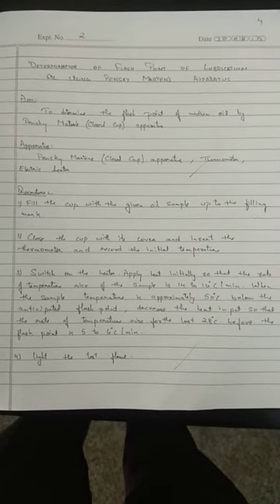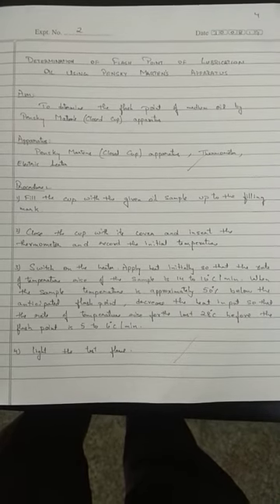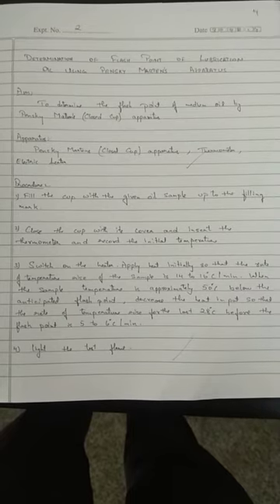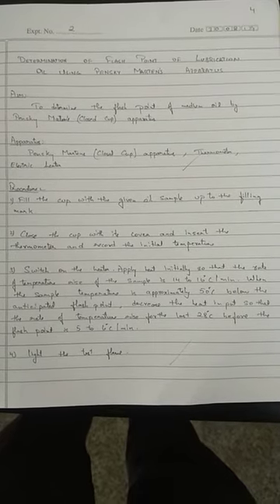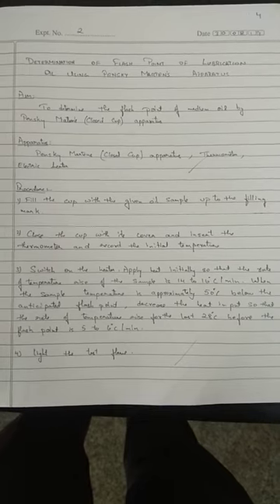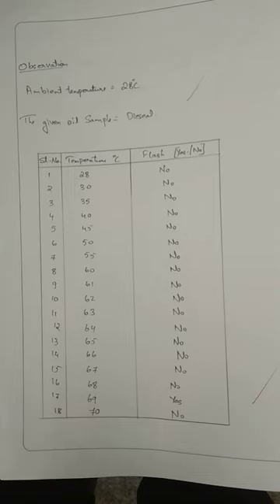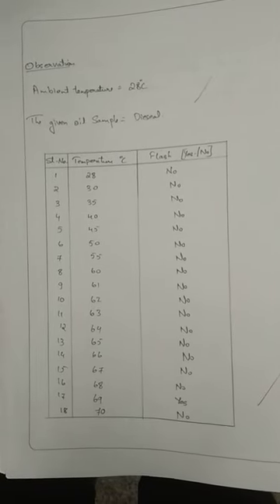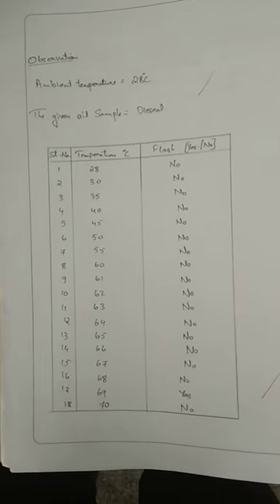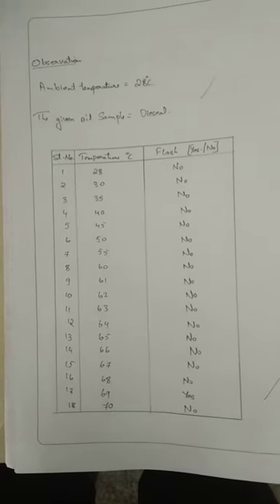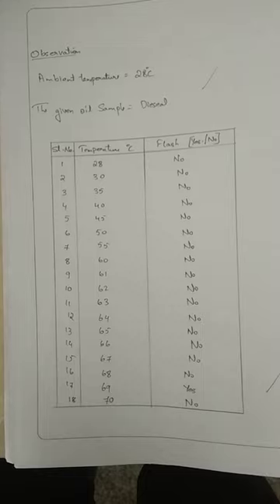Good morning students. We will conduct an experiment on determination of flash point of lubricating oil using the Pensky-Martens closed cup apparatus. Here is a tabular column where you have temperature on one side and flash on the other — you have to note down the temperature at which the flash will occur. Here we are going to use diesel as the sample oil.